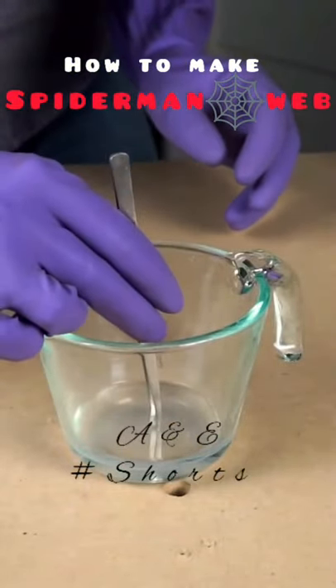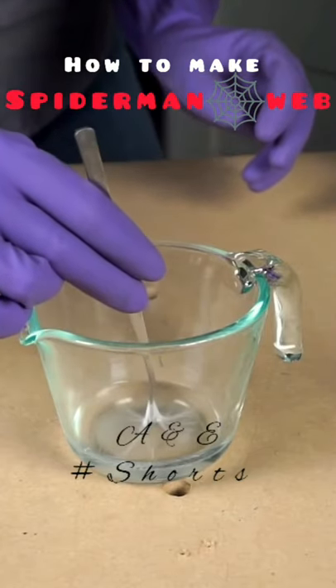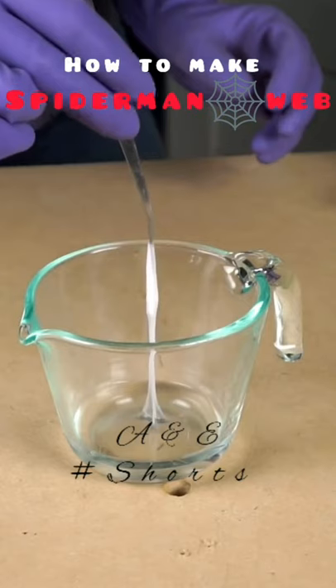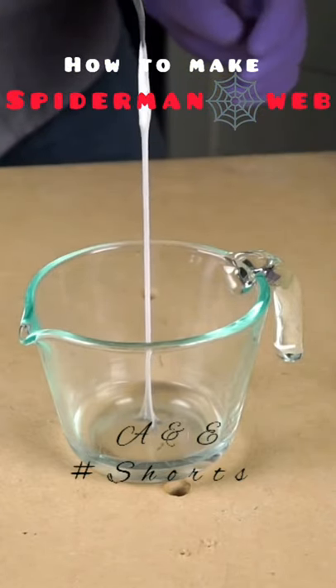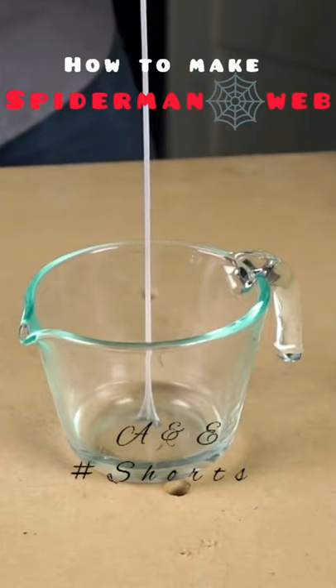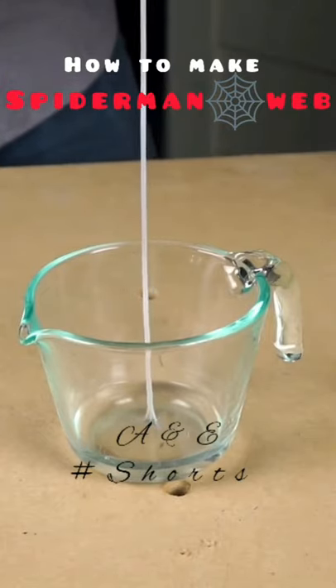Then I just grab the polymer it forms in between and pull, and it'll keep pulling the string out of the center there. It just keeps coming. That's so cool.